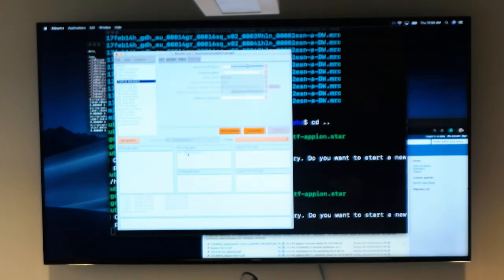Anyways, when you first create a job, based upon this job, it'll have a root name. This is job 1, and it says that's the extract job. You can do certain things like, I actually want to change the name of this job.